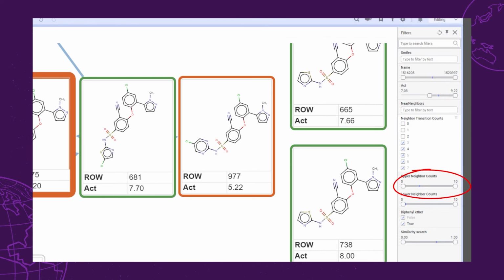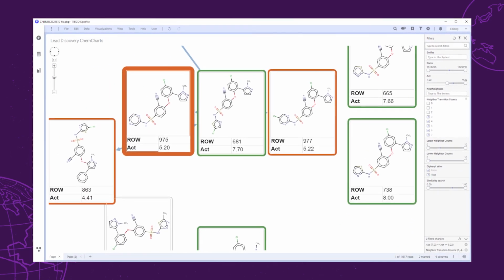The upper neighbor counts column, computed automatically when the visual is opened, contains the number of neighbors in the same activity class. If enough neighbors are found to establish a neighborhood, one might hope for structure-activity relationships to come directly out of the HTS hits. The definitions of active, inactive, or any other desirable property depends on the experimental data in the data table and the user's definition of the activity or property classes.